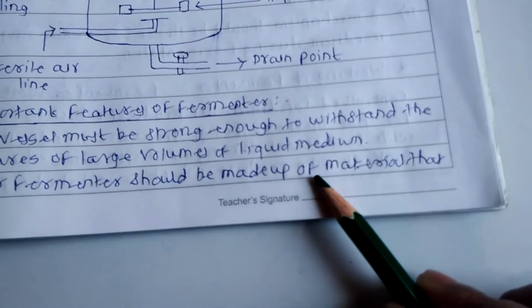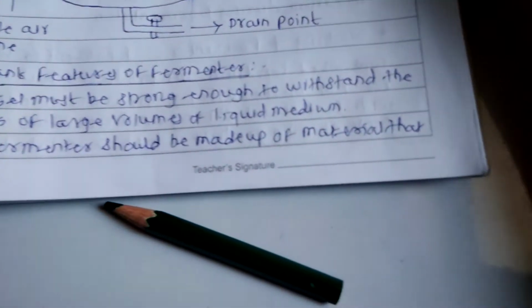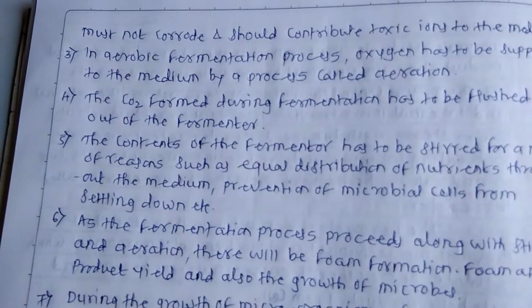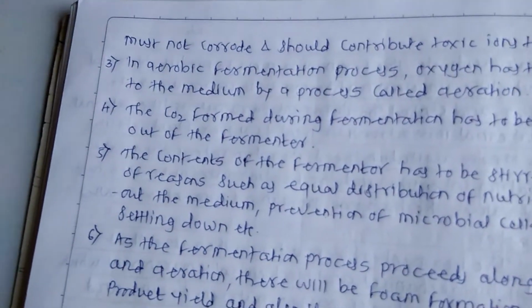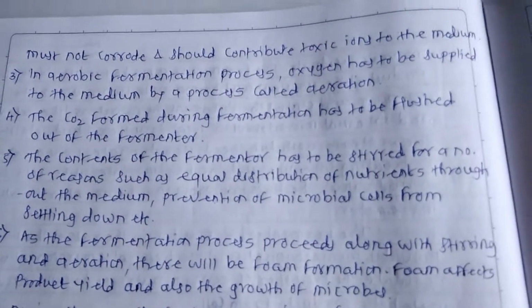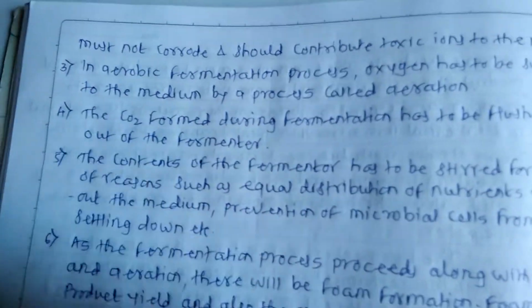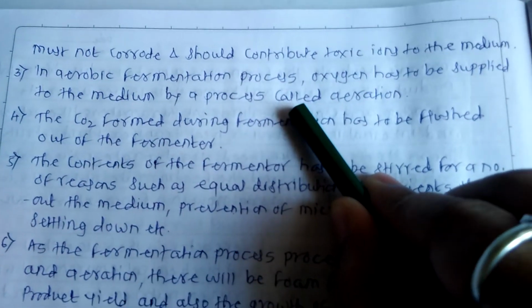Second, the fermenter is made of such materials that it must not corrode, so the materials used in a fermenter are good. Next, in an aerobic fermentation process, oxygen must reach each and every part of the media and of the fermenter.